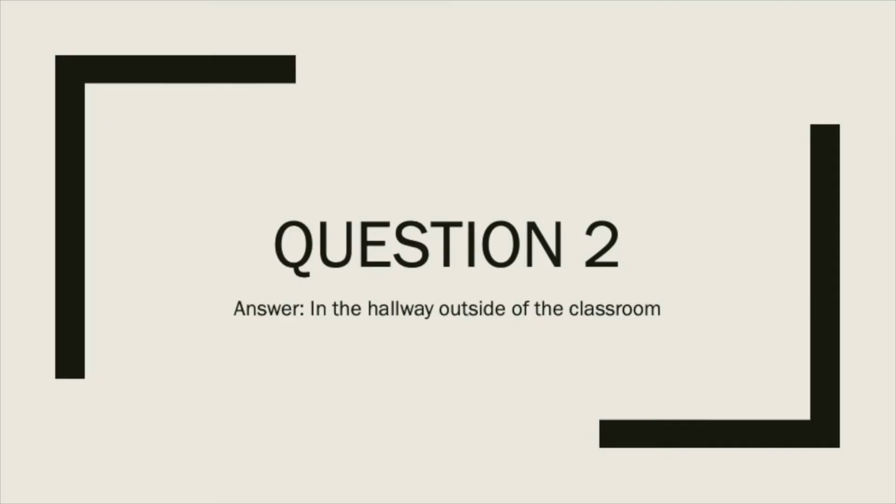Number 2, where's the eyewash station located? It is located out in the hallway. So if you go out the front door, take a right, there's a shower and an eyewash station in the hallway beside the ice machine. That would be used, of course, if you got anything in your eye or anything like that.